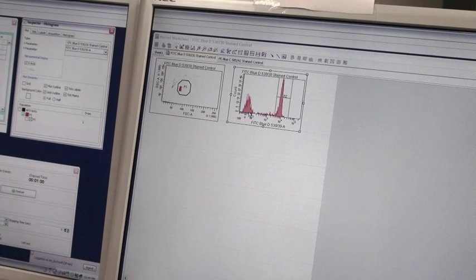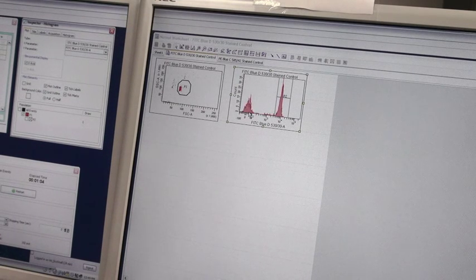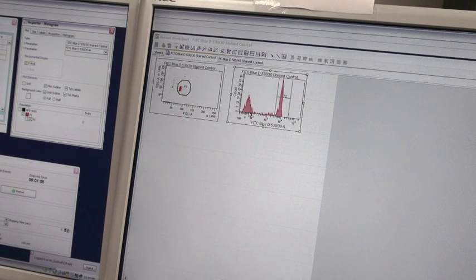When you run compensation, it is very important not to rely on a universal negative. Let each sample have a positive and negative control in the same tube.